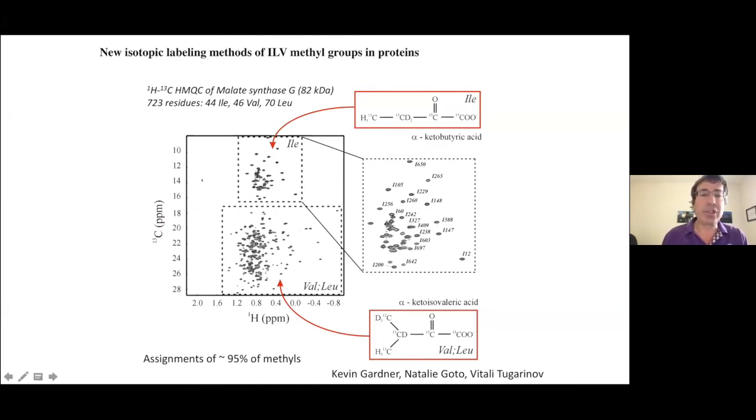And this is just an example of the sort of spectra that one can generate. This is a carbon proton correlation map on malate synthase G, which is 82 kilodaltons and 700 plus residues. It was considered very big in the lab some 15 years ago or so when Vitaly was working on this system. And using technologies that we published over the years, we've been able to assign something like 95% of these methyl groups to specific sites in the molecule. And these then serve as probes of molecular structure and dynamics.